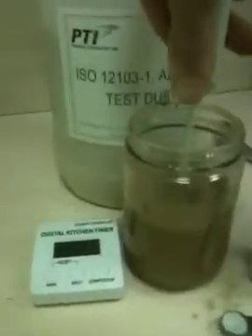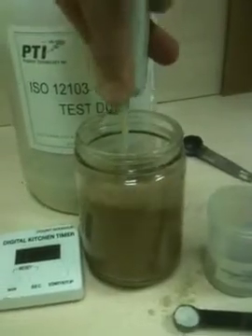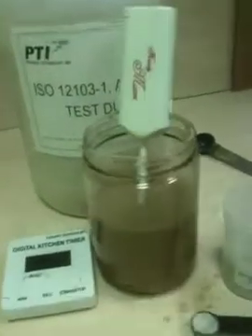We are going to give this a quick mix just to make sure that it is all mixed in. And then we are going to add our Floccan. Clock is at zero.